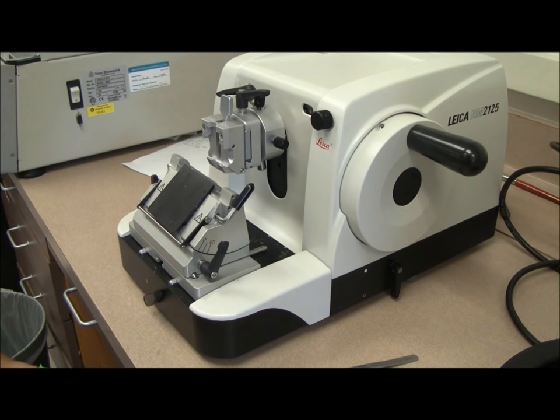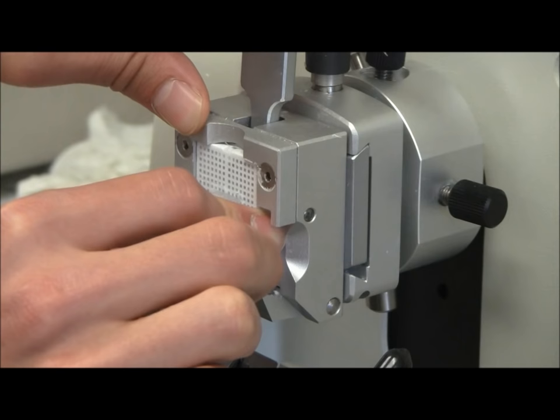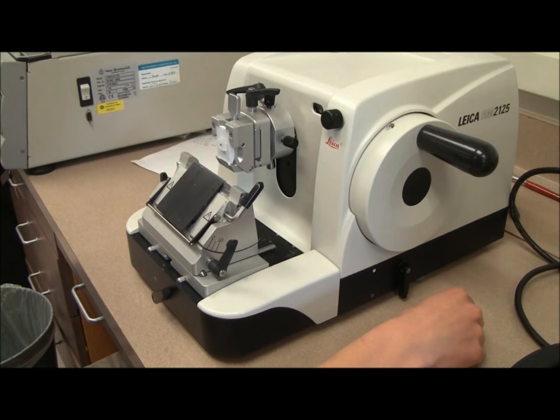We'll do a quick run through of the basic operations and then demonstrate how to cut sections from an eye and get them onto slides. Use this lever to secure your tissue block to the specimen clamp.